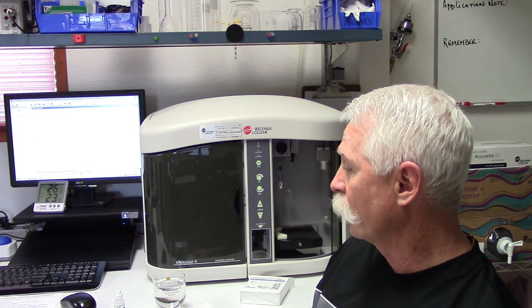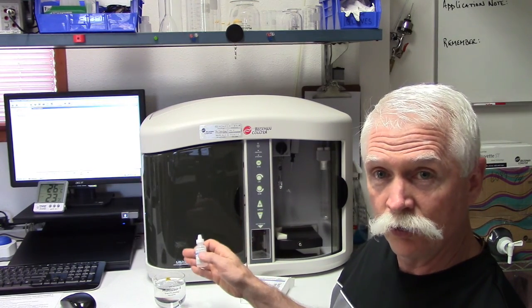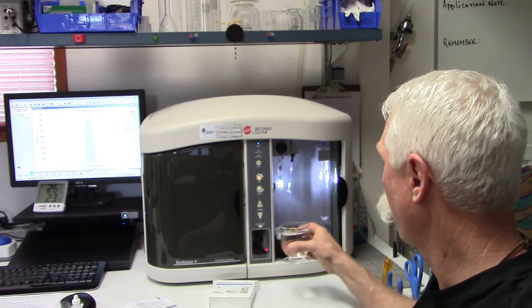You're basically going to add about 25 to 35 drops of the control standard to the beaker. Once that's done, you're going to load the beaker onto the platform.